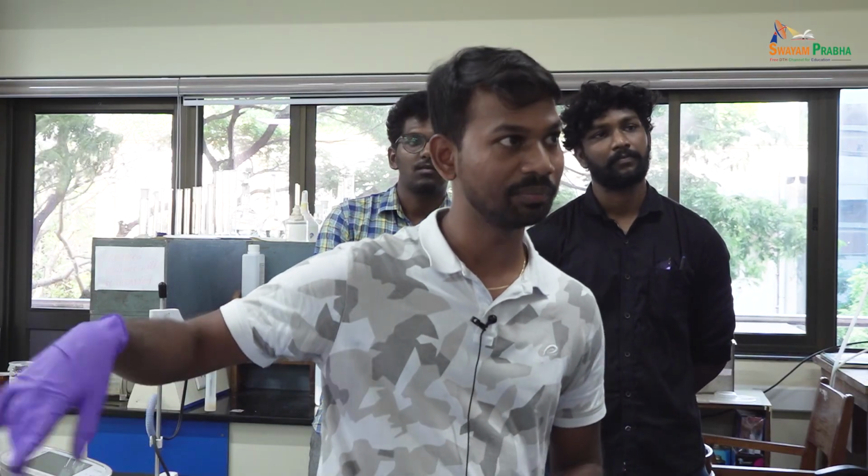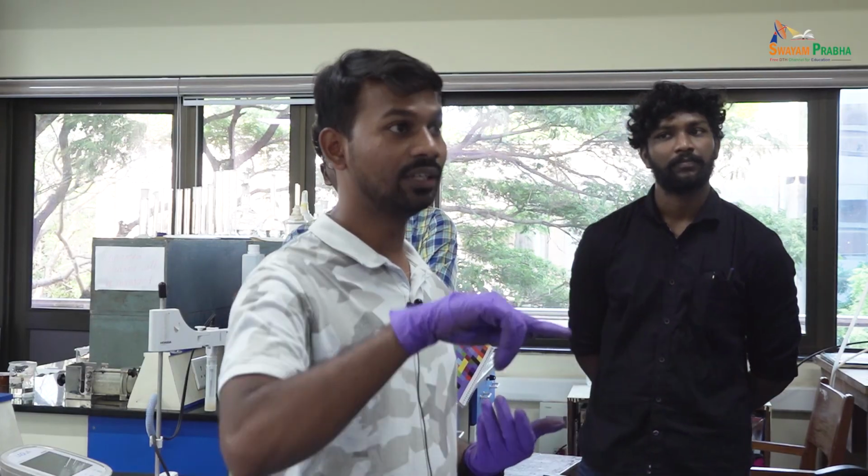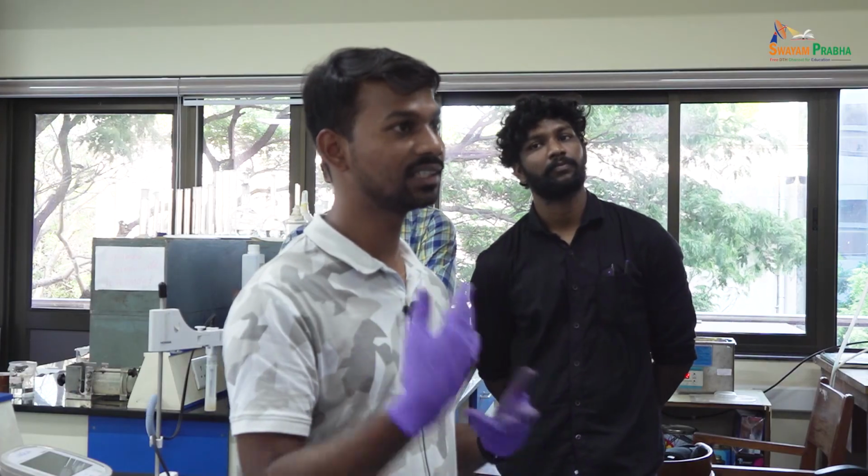What are the types of corrosion we can observe in this? Uniform corrosion, generally this one. Pitting you can observe from the upper portion of the PD curve. Pitting generally comes under active passive materials, where you can see when the passive layer is breaking down. So, we will use a repassivation technique to find out the susceptibility also.